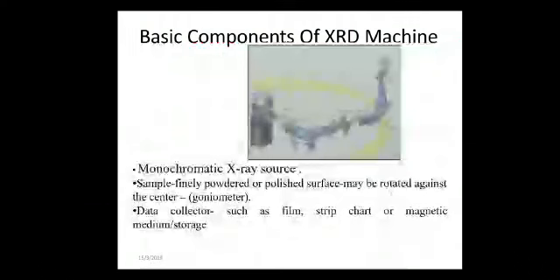We have studied these in high school, along with electrons, charges and the periodic table, under physical chemistry. So here in X-ray diffraction analysis, when the atom is bombarded with an electron, it ejects one of the electrons from the inner shell.